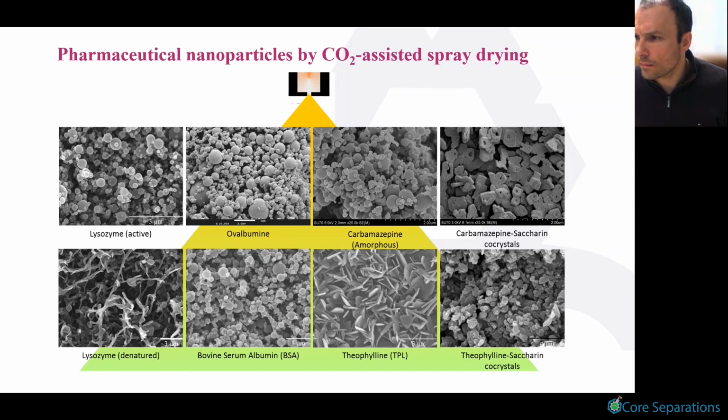Have you ever tested your methodology against a fluid bed coating of those MCC particles? So you have then a continuous layer of your API. So is it better if you have nanoparticles on your MCC than a continuous layer?